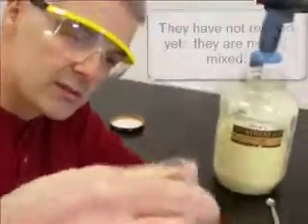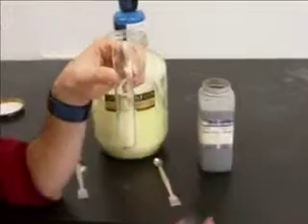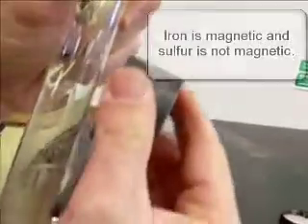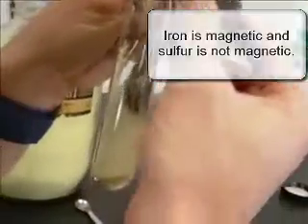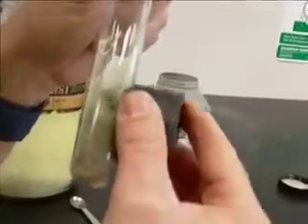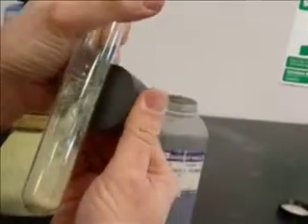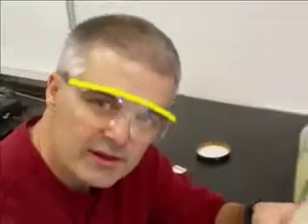Okay, mix, mix, mix. And they still haven't reacted. Now, one way I can know that is I happen to have a magnet right here. And if I take the magnet, I don't know if you can see this. I think you can. I can move the iron. The iron, of course, is attracted to the magnet. So I can do that. The sulfur stays at the bottom. You can kind of see how the sulfur is not attracted to the magnet, but the iron is. So now this is essentially just a mixture of iron and sulfur. So they have not reacted.